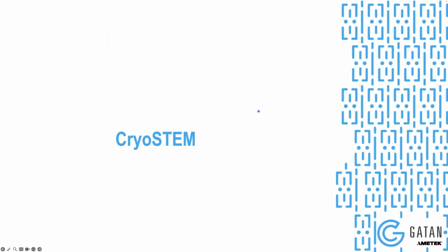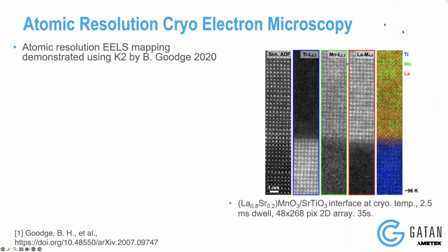So the first of which is CryoSTEM. This is something that has been demonstrated before, actually. Really nice work by Barrett when she was at Cornell, 2020. I think the experiments actually started a few years before that, but this was published on arXiv in 2020.